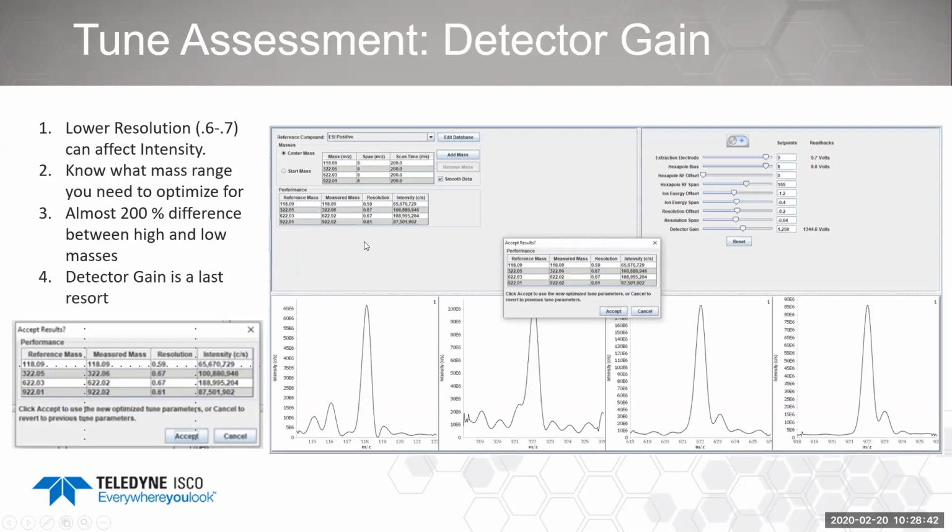So we can actually also do a custom ionization setup where we tune specifically and optimize these individual values. And that would be changing these values over here. It's something we would suggest that you let us do, as our service team would come in and either do a PM or work with you on this type of process, or our support team. Anyhow, as you can see, now we're getting a 65 to an 87 differential with about 100 to 180 in the middle.